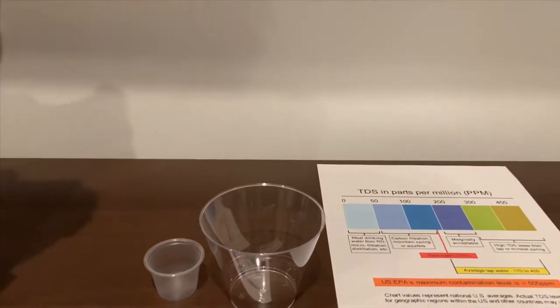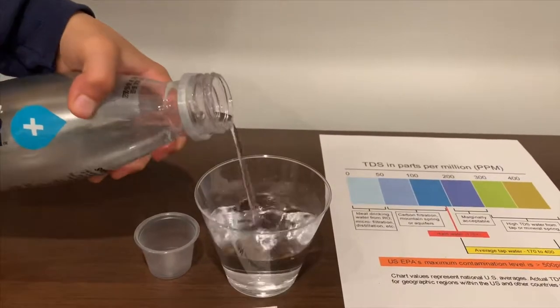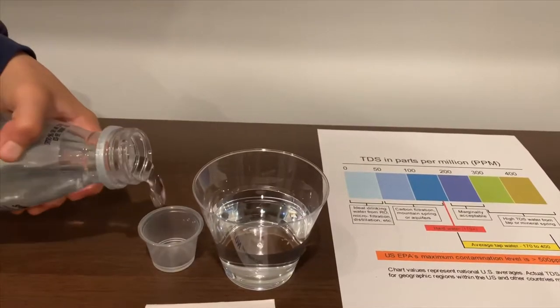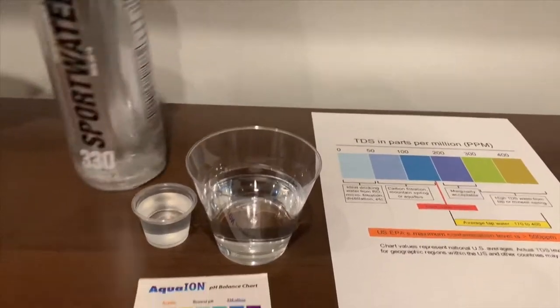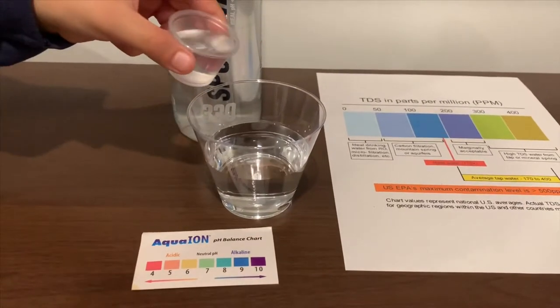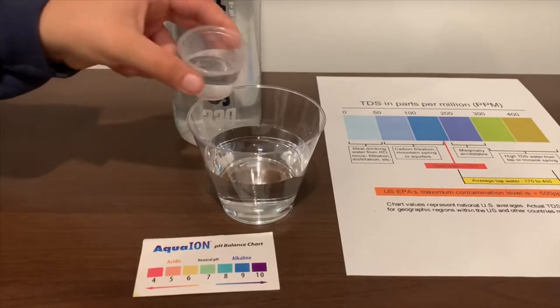Let's pour some water in. This is a little too much for the pH cup. Let's pour some back into the TDS cup. A little more.